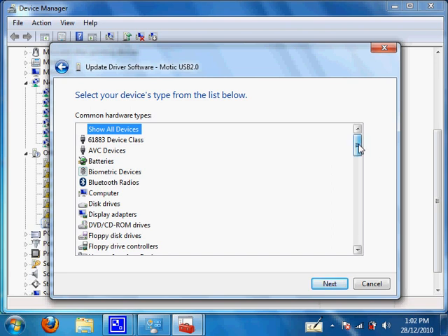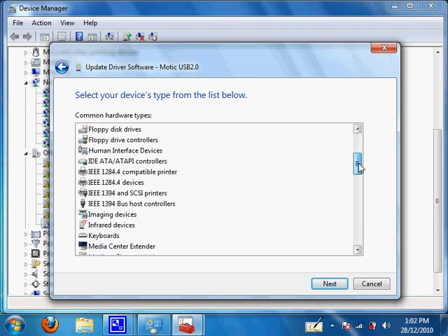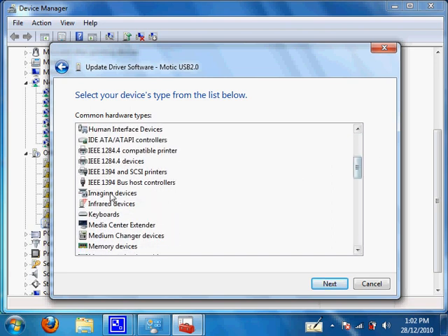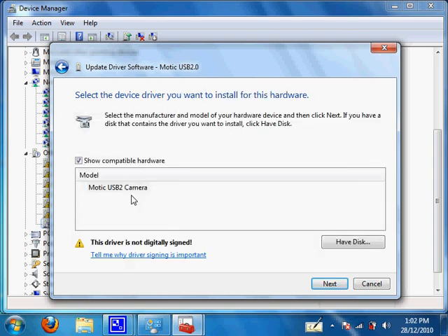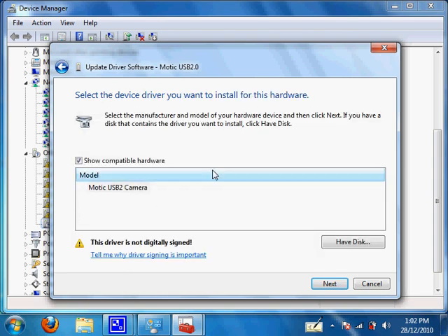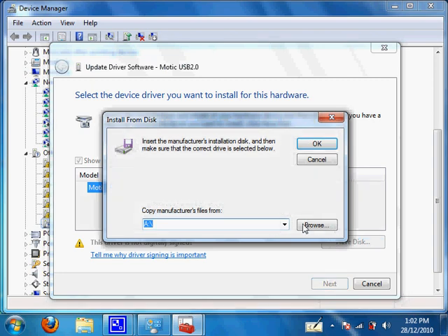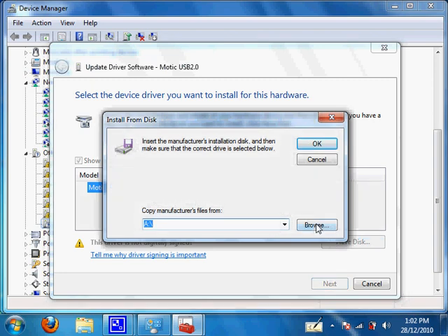Once we get to this part, click on imaging devices, and then click on have disk, then click on browse.